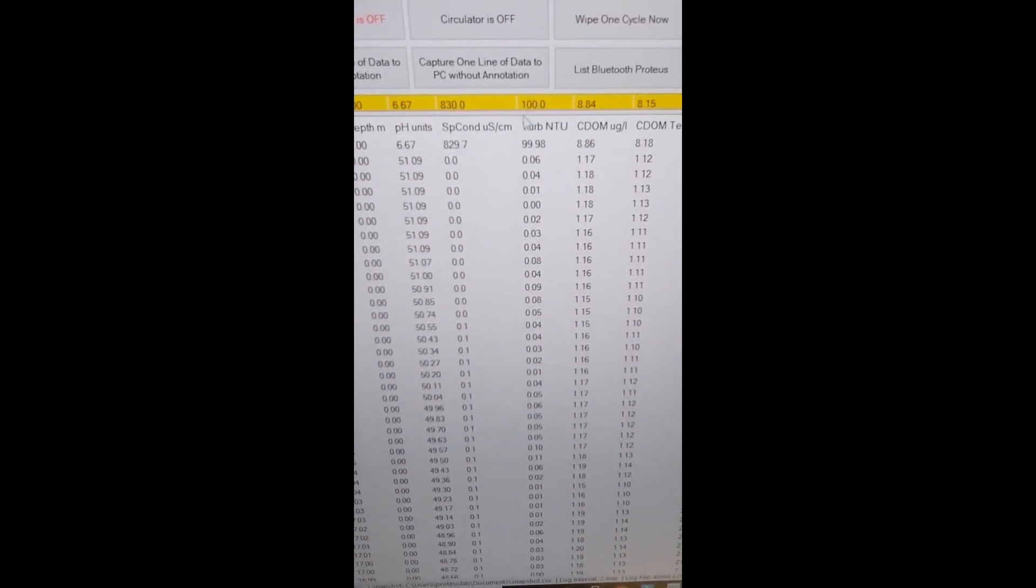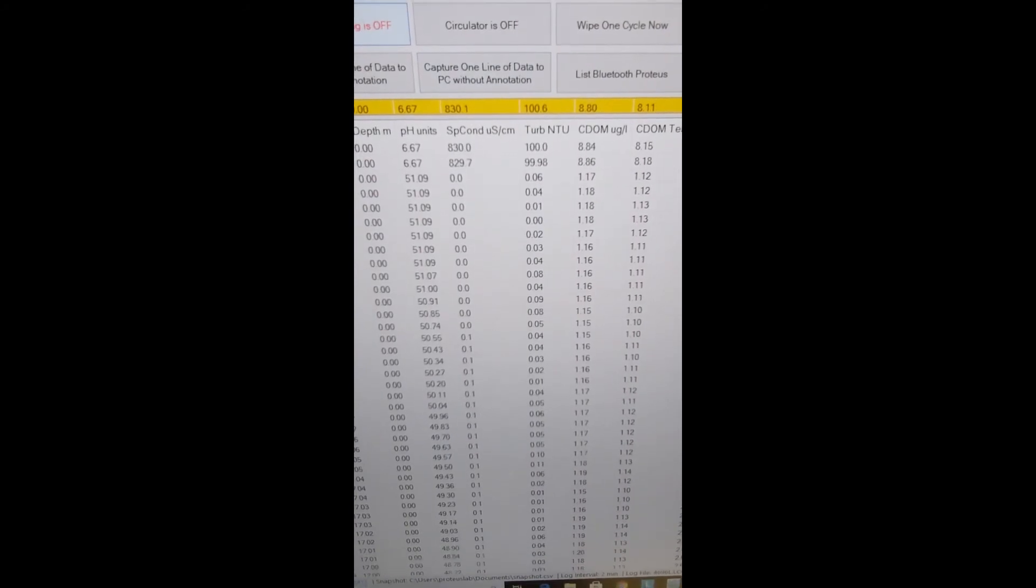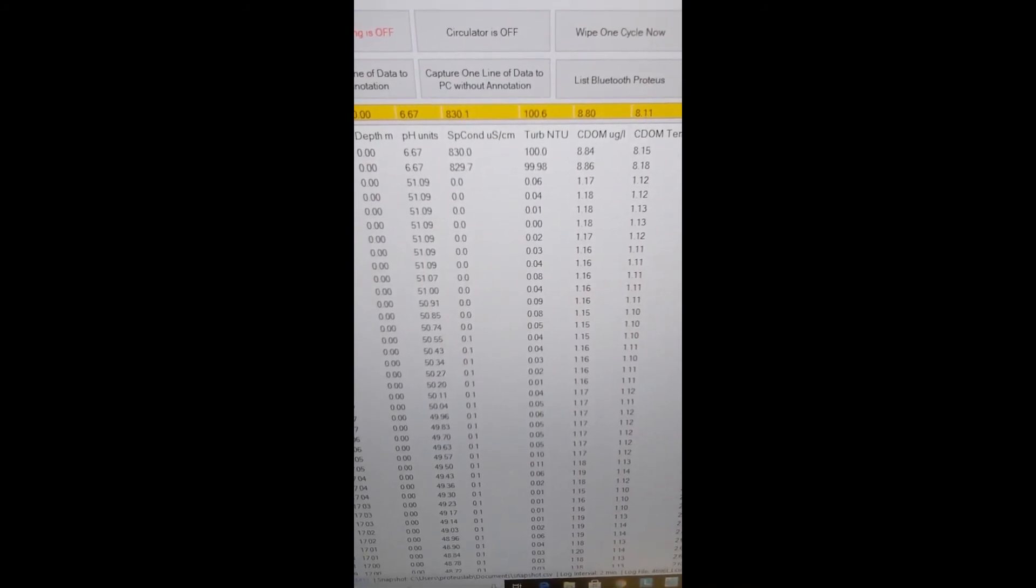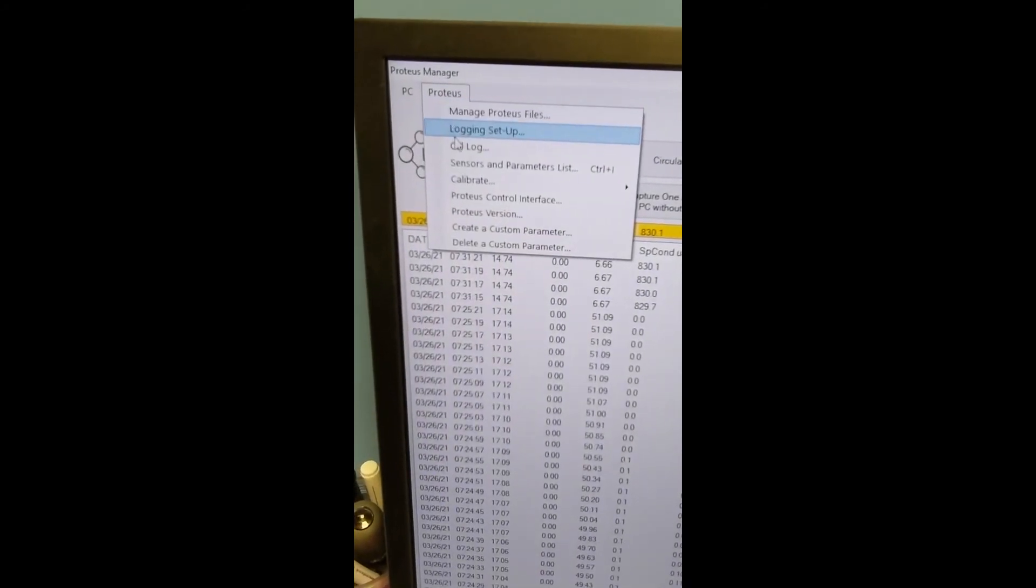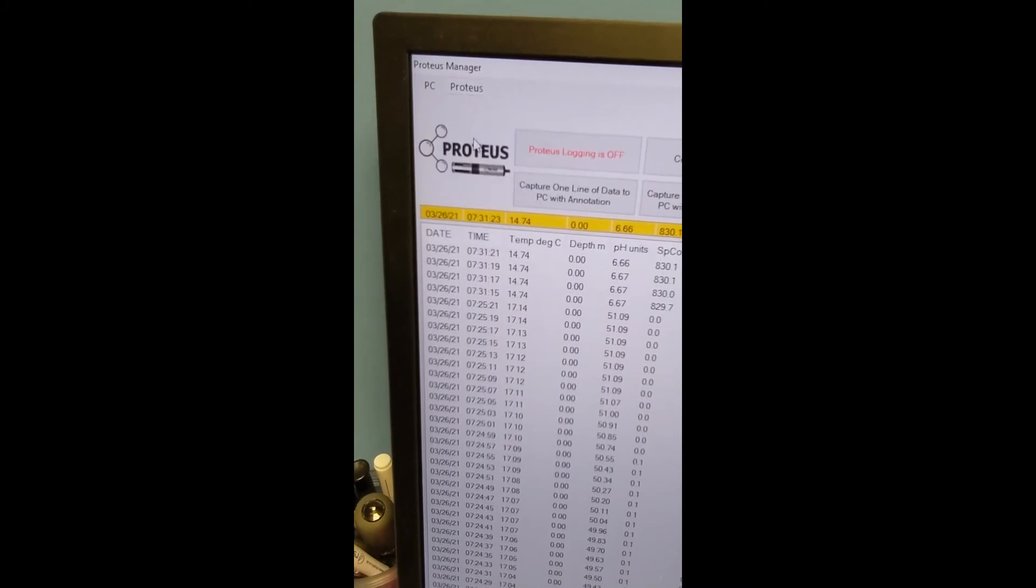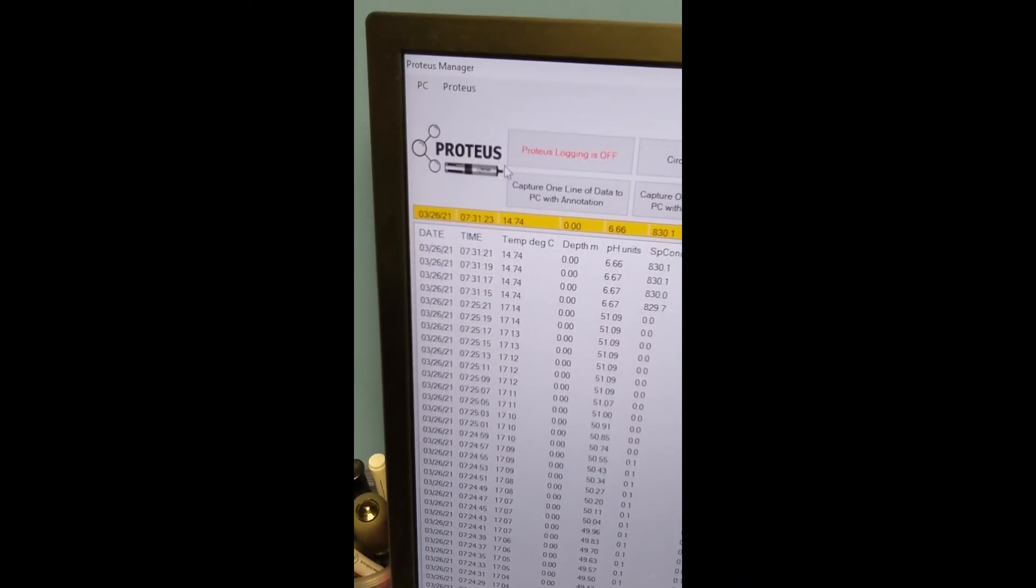There we go, it's calibrated now to 100 NTU. If we then go onto the Proteus menu and click on calibration log.